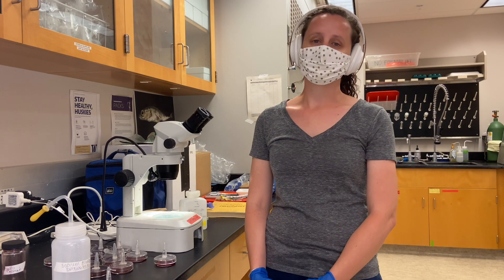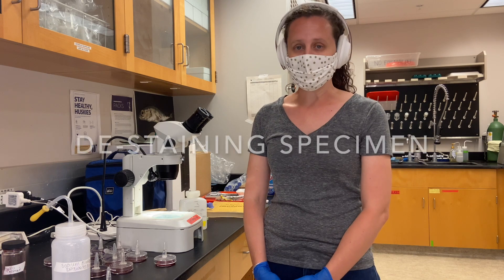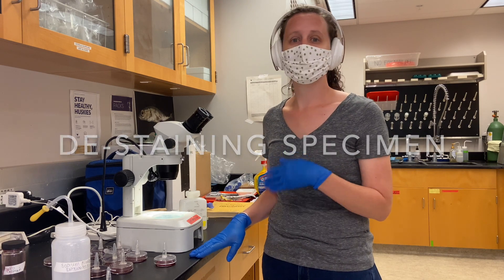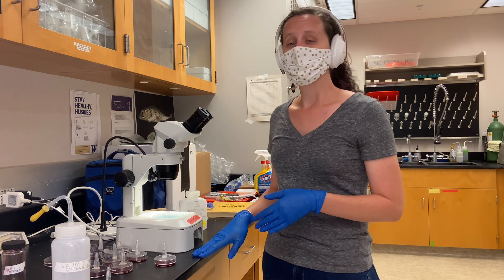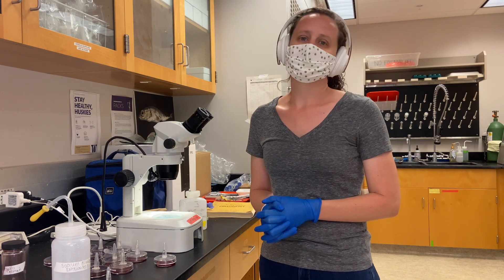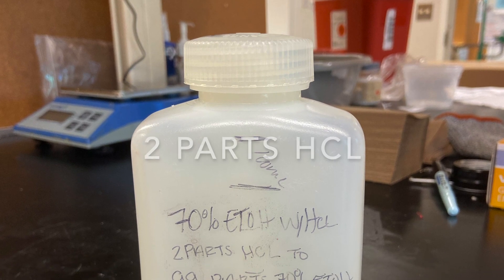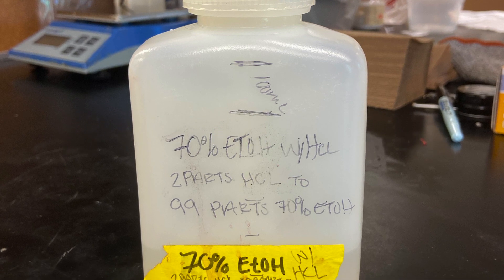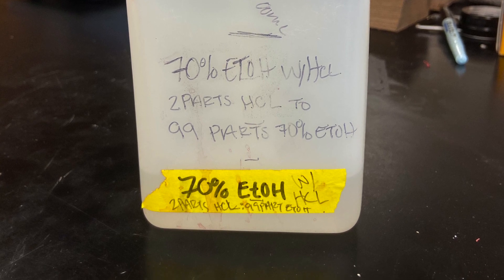The specimens have stained anywhere from 12 to 24 hours — we did it overnight. Now we're going to start the process of de-staining. When the specimens are in the stain overnight they over-stain, so we're going to de-stain them so they're not a dark red color and they turn into a nice light pink where we can see a lot of their internal morphology. We're going to de-stain the specimens using an acid alcohol — this is two parts hydrochloric acid to 99 parts 70% ethanol. There's a little bit of wiggle room as to how much acid you include, but generally this is what I choose to be safe.